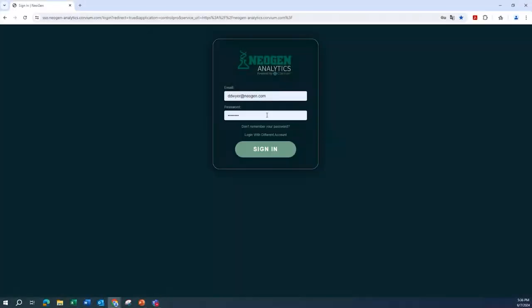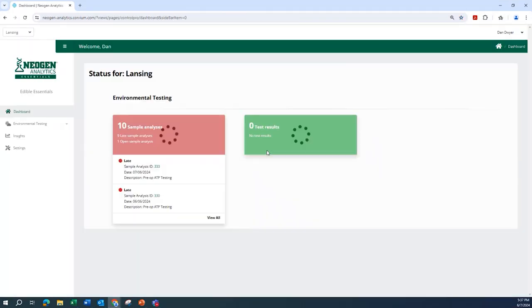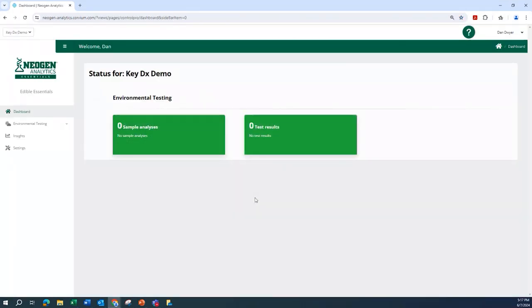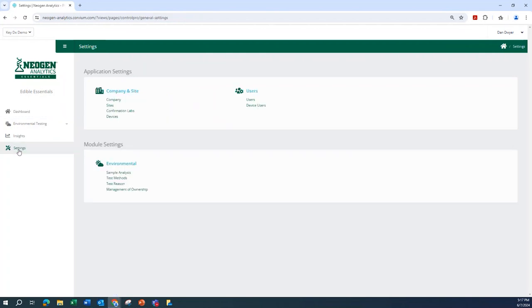The first step is to log in to your Neogen Analytics Essentials account. Once your LM1 luminometer order is placed, Neogen's customer success team is notified to create login credentials for your organization. They will reach out and provide guidance on onboarding and software access.